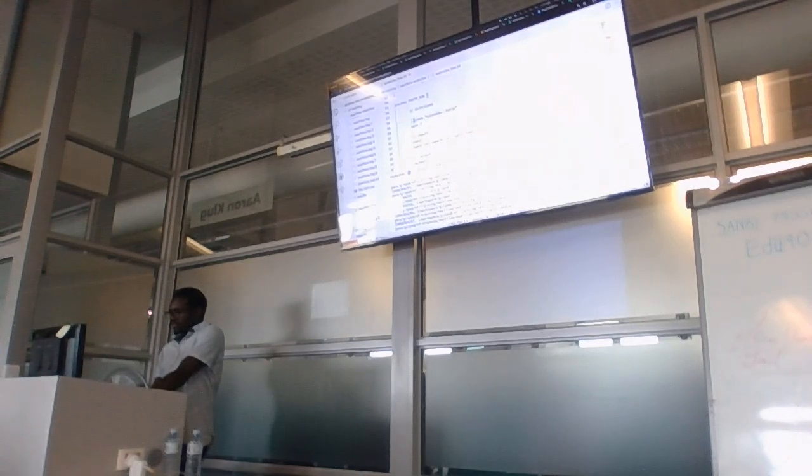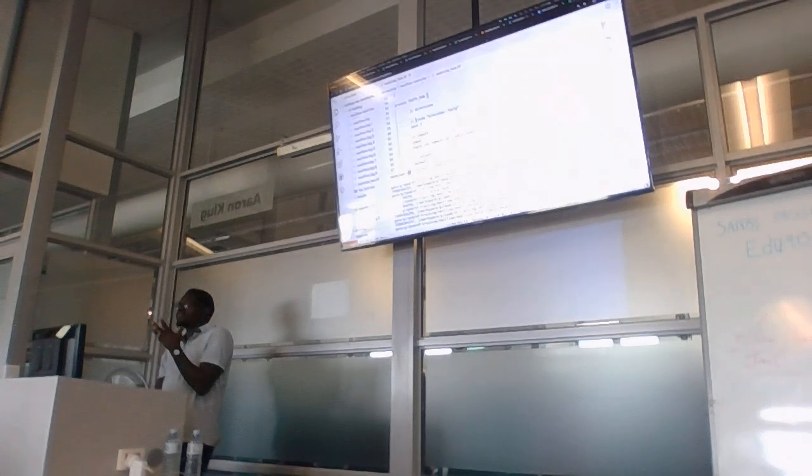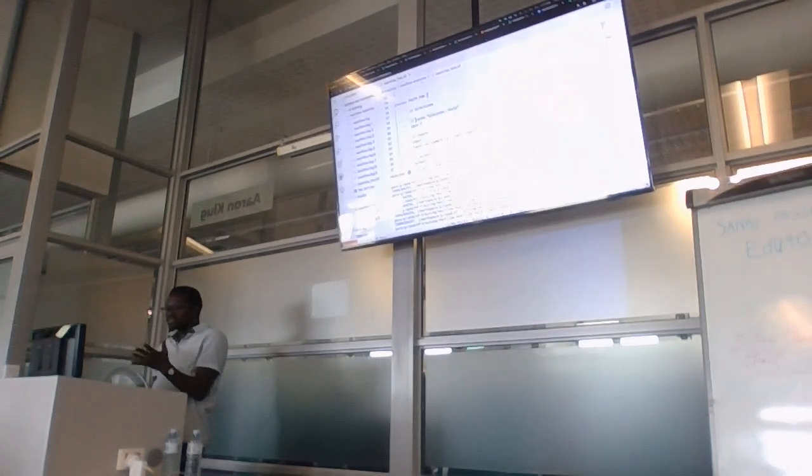So to test whether this process will run successfully, I'm commenting out the conda directive, and we will attempt to run it without this fastp.